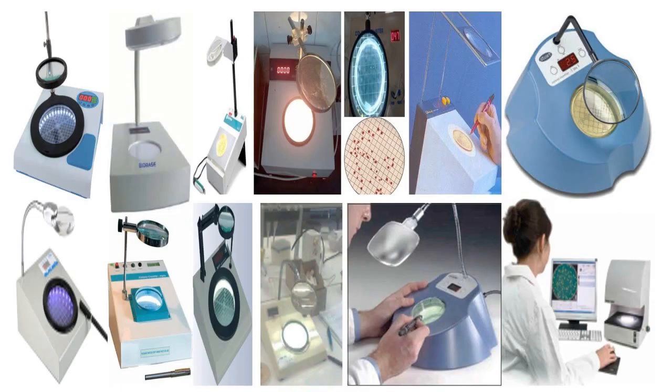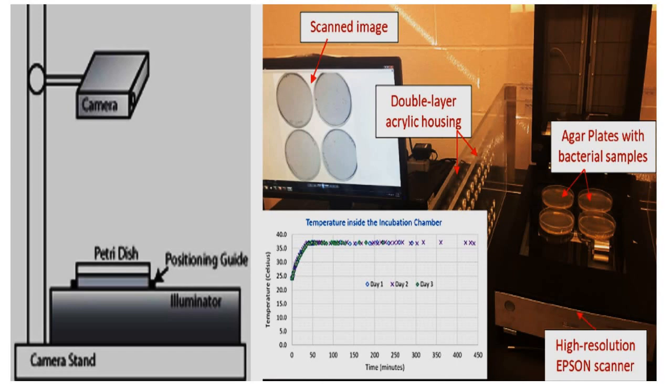Additionally, this slide demonstrates bacterial colonies counting by bacterial counters. And this slide displays bacterial colonies counting by camera scan.